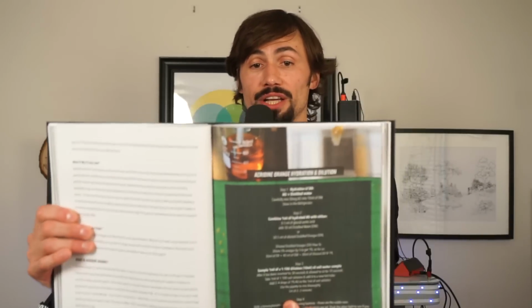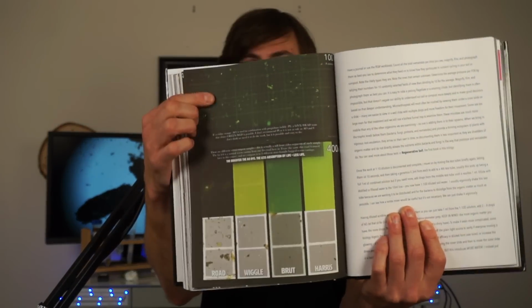The whole recipe, all the directions, all of this is inside this book, Regenerative Soil Microscopy. I wrote this book so that folks could literally just start in on this and do the work. This is the hydration. This is how to hydrate it and then dilute it, because you have to hydrate that powder, and then dilute it. And here's the side-by-sides in the book. There's the hemocytometer. So it's all in here, as well as how to calculate things, how to count things.